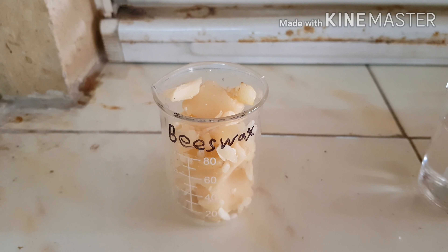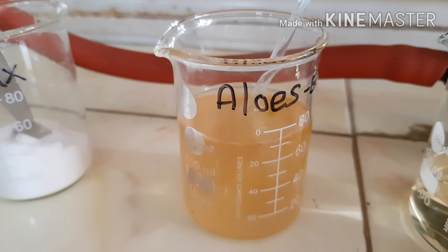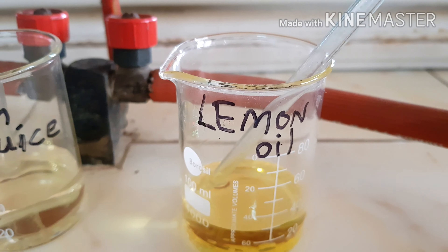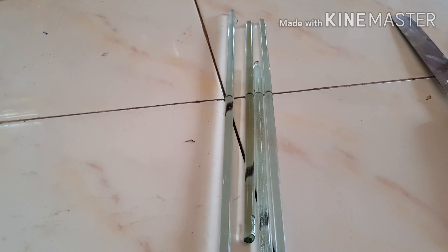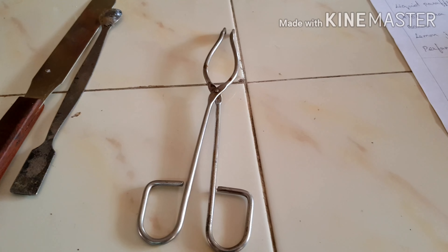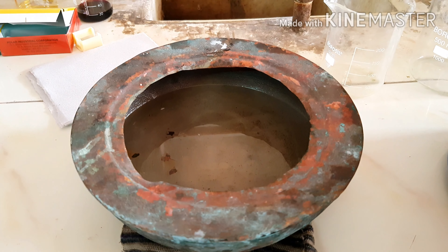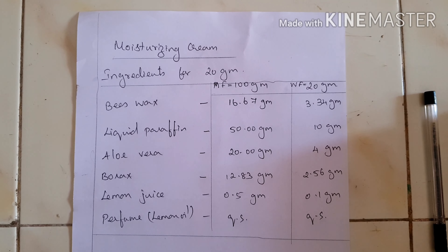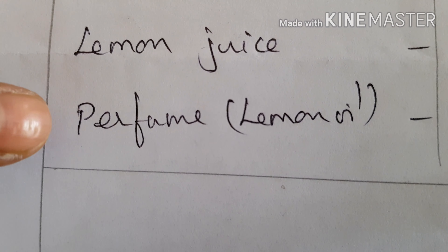The materials required for preparation of this cream are: beeswax, liquid paraffin, borax, aqueous aloe vera extract, lemon juice, lemon oil, and a dispensing container. Equipment includes a weighing balance, measuring cylinder, glass rods, spatula, tongs, china dish, and a mantle water bath. The key ingredients are beeswax, liquid paraffin, aloe vera extract, borax, lemon juice, and a perfume.